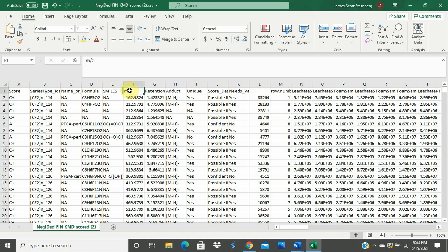The retention time column should follow a time order in the homologous series. Once again, taking a look at series 114, you'll see the retention times increase with each feature: 1.4, 4.7, these two are off, 5.9, 6.4, 7.04, 7.74. The exception here, like I said, are rows 4 and 5.